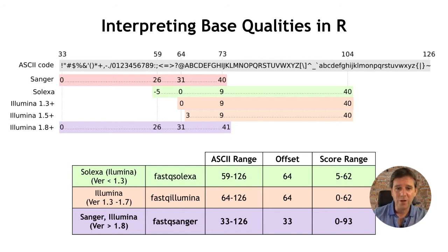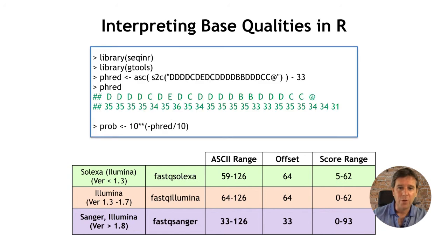If we were motivated, and we'll maybe skip this step, we could read out in R, take that quality score line and determine the number, what's called the Phred score. It comes from an older program called Phred that used to calculate the quality scores of these things. We could convert them from a character to a string, then ASCII to numbers, and then subtract that offset, minus 33, and determine our Phred score. We'll skip this step because we'll see them in a second.